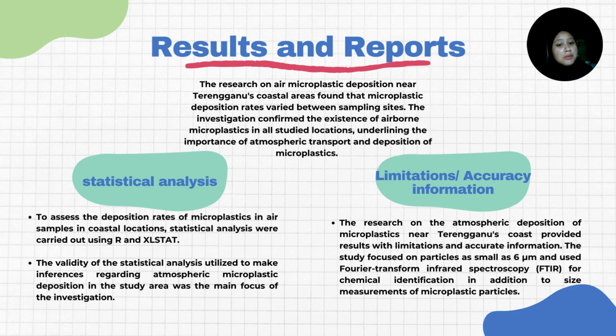The next one is limitations and accuracy information. The research on the atmospheric deposition of microplastic near Terengganu provided results with limitations and accurate information. The study focused on particles as small as 6 micrometers and used FTIR for chemical identification in addition to size measurements of microplastic particles.